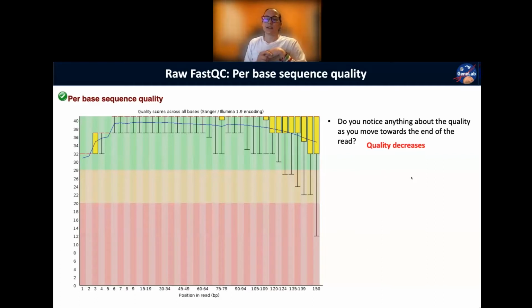So which is kind of like an instrument, but really more a substrate, a caveat of the substrates being in there over time. So we do tend to say it's pretty common for all those reasons to see the quality kind of drop off at the end.